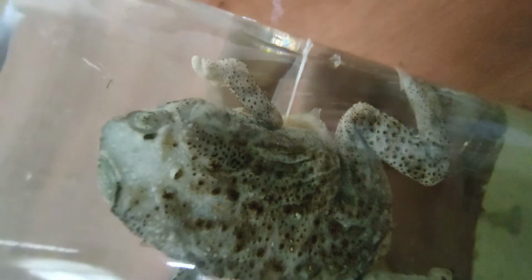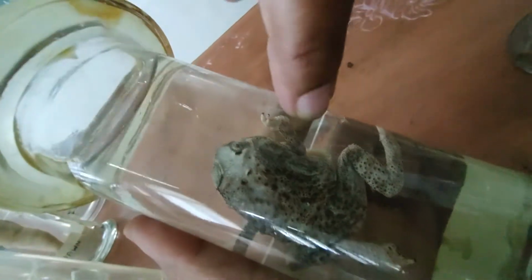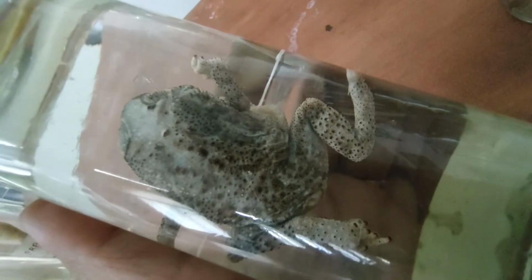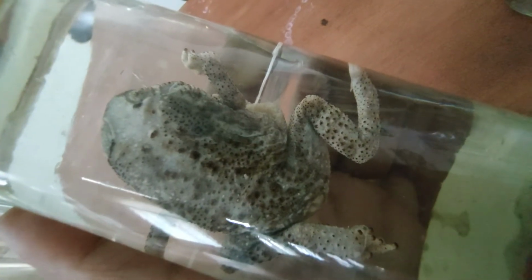From that pectoral girdle 2 arms arise, and they help in locomotion. Then the body is differentiated into head, the middle region called the trunk, and the last portion called the tail. Neck is absent in this animal. In some animals the tail is absent.